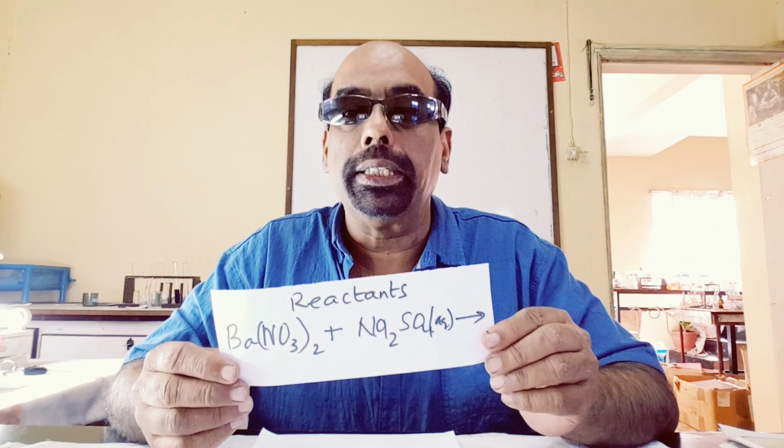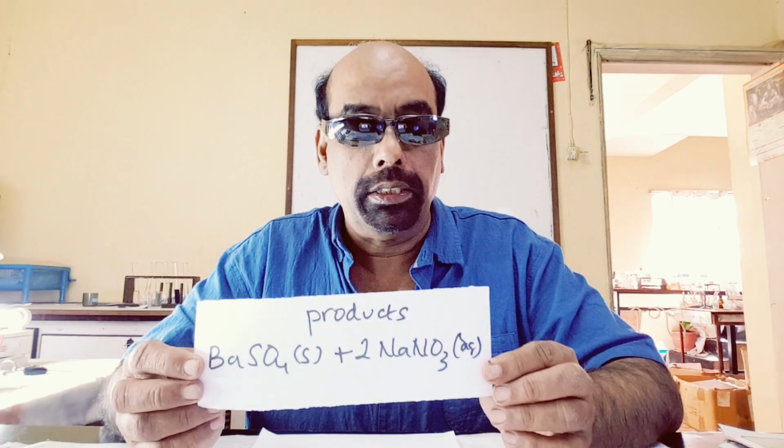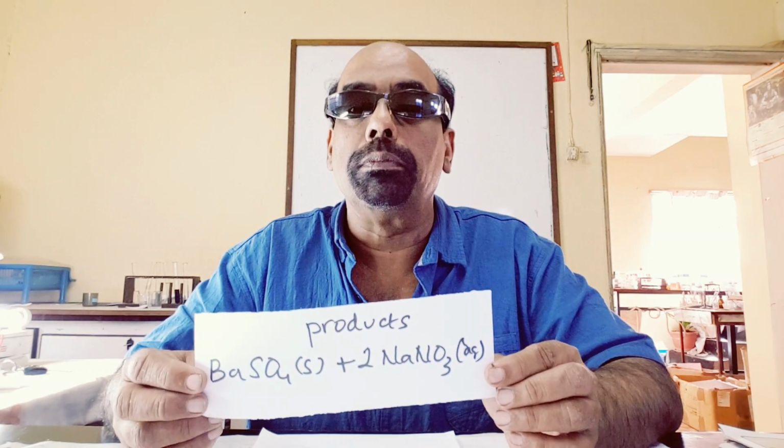A reaction will take place. Barium sulfate, a solid, and sodium nitrate, a solution, will be formed.